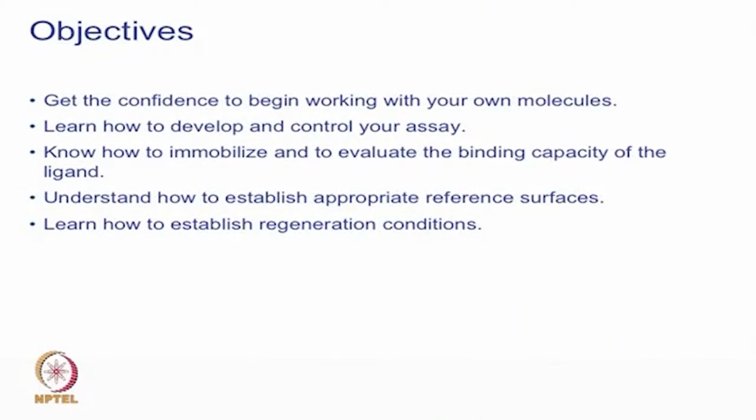In this session, we will understand how we can develop an assay, a Biacore or a surface plasmon assay. The objectives of this particular study are to understand how to work with the molecule, how to develop an assay, control an assay, and we will understand about the reference surfaces and also about the regeneration of the surfaces and all that.